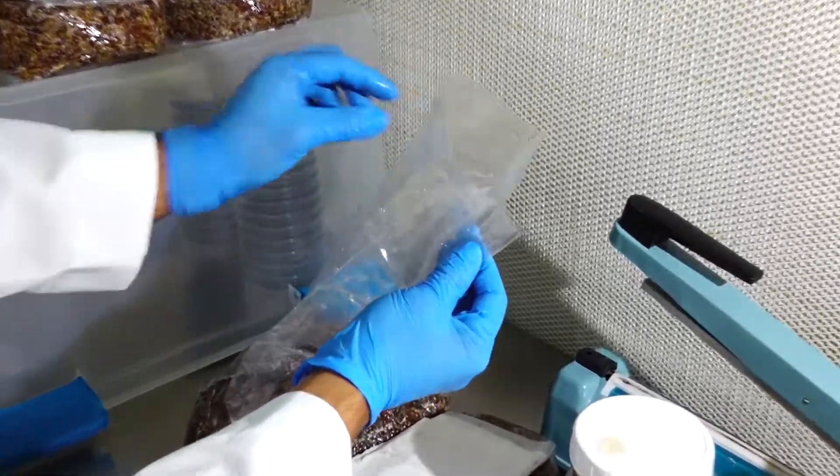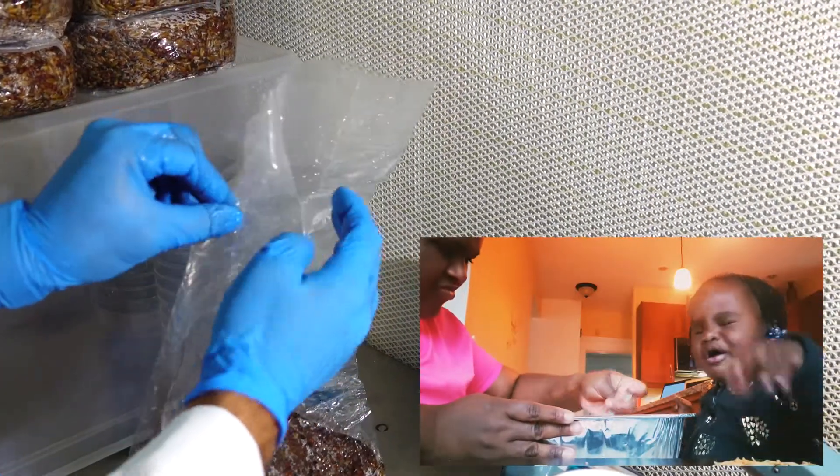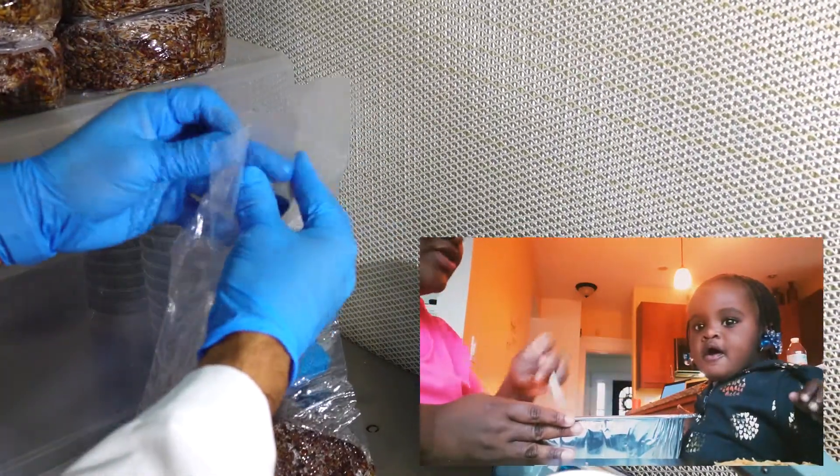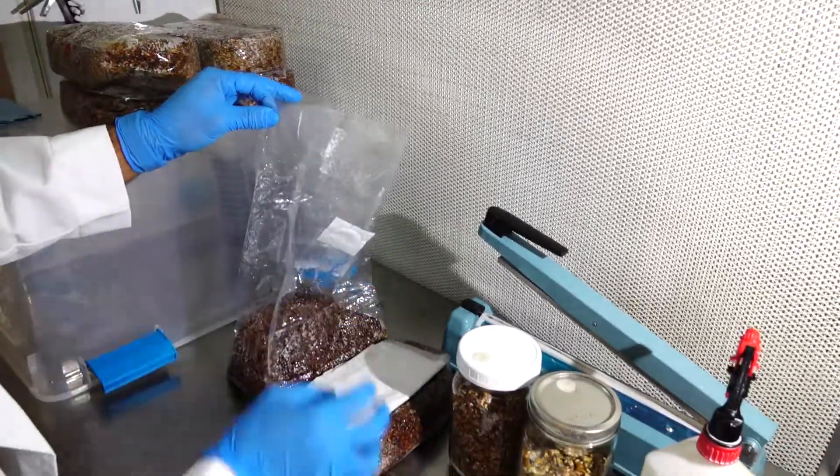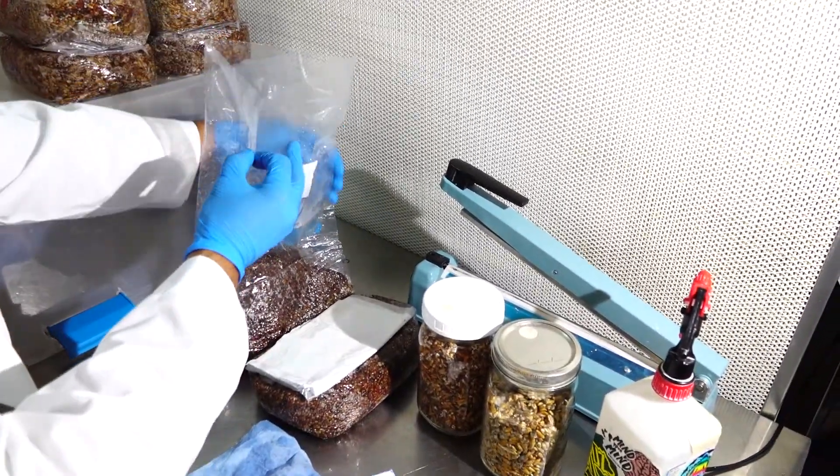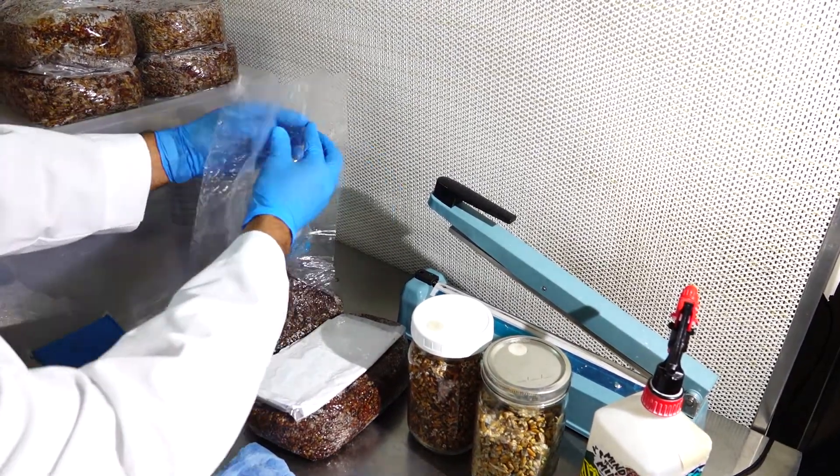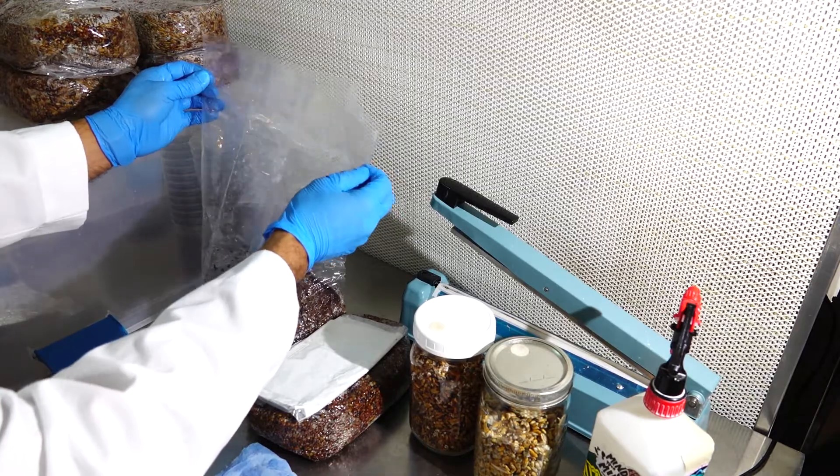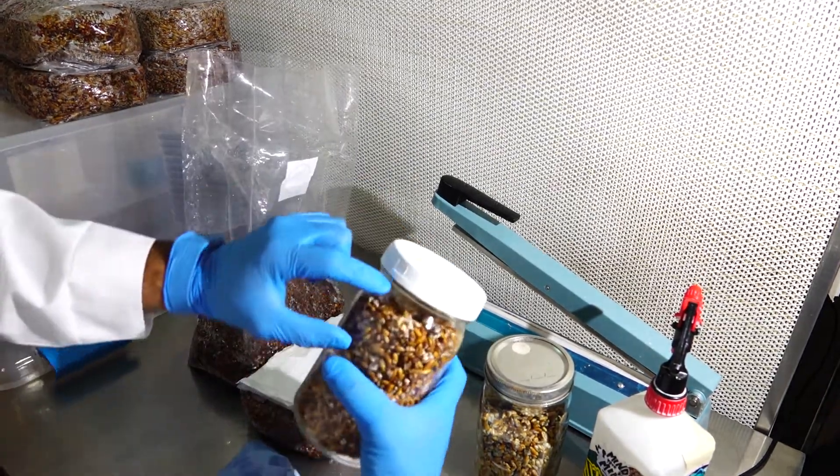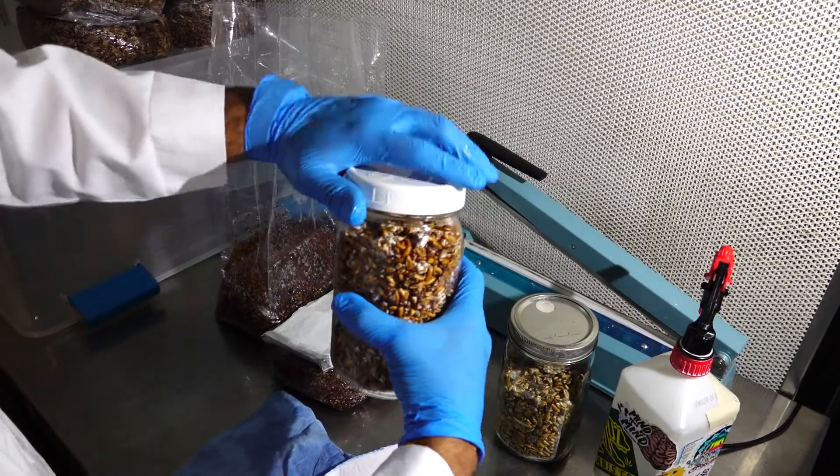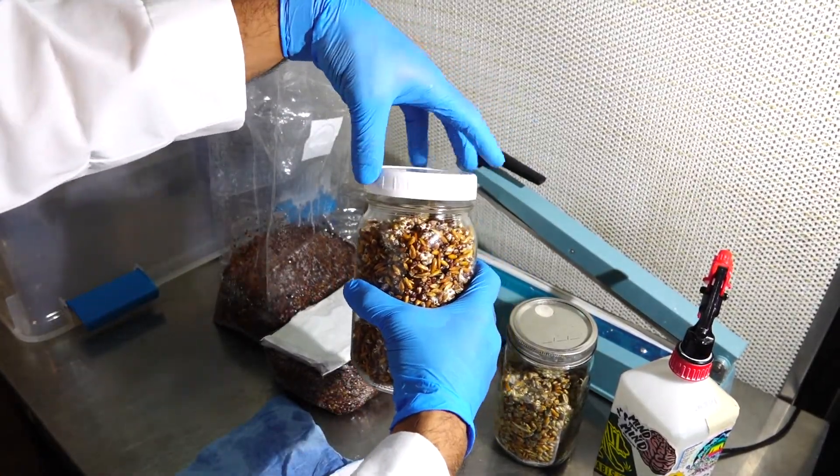You never want to put your hands above the top of the bag so that you don't introduce anything into the bag that's unwanted. As you can see here, the tyvek method worked really well from our previous video and that allows the bag to be almost sealed on its own without the need of an impulse sealer prior to inoculation.